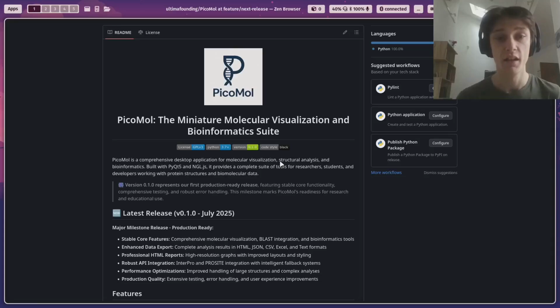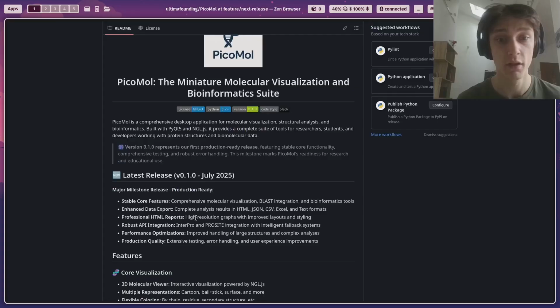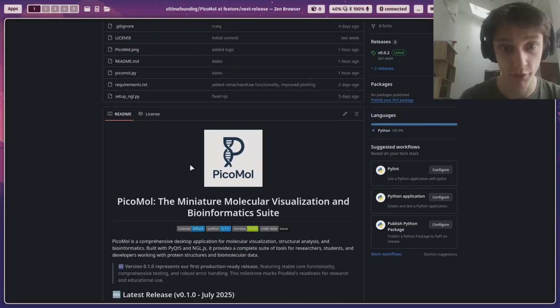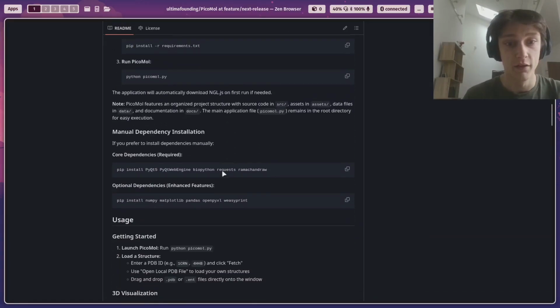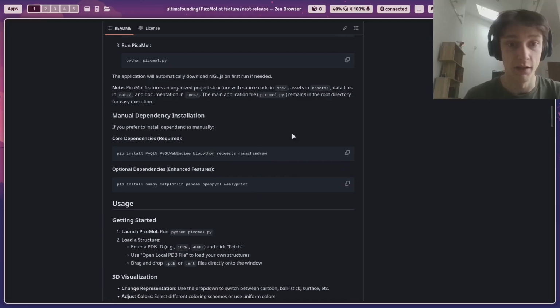Hey guys, just giving you an update on PicoMol. I have just finished all the features for version 0.1, and I'll run those through with you now. We've also got a new logo for the project and a few more dependencies.